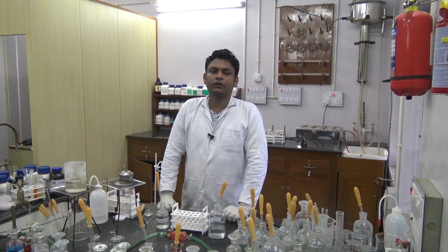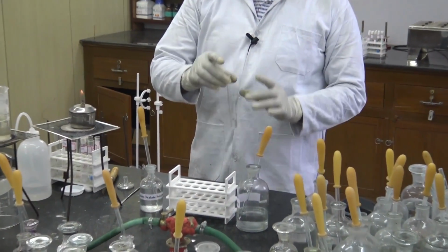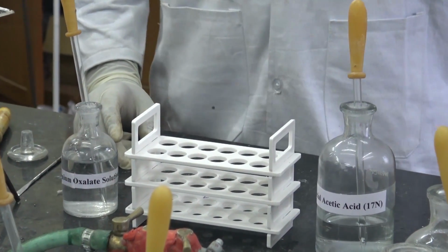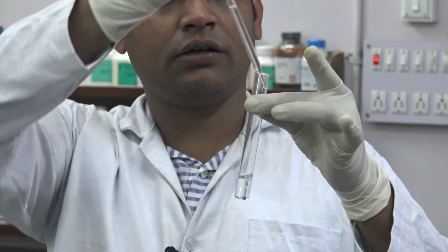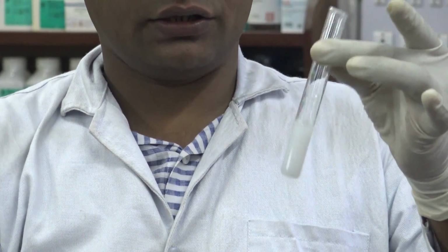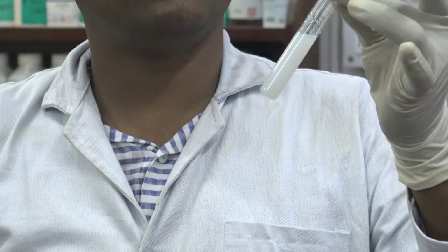Now we will go for the test for calcium ion, that is ammonium oxalate test. For this reaction we need sample solution, glacial acetic acid and ammonium oxalate solution. To perform this reaction we have to take the sample solution, then add few drops of ammonium oxalate to it. Here you can see formation of white precipitate occurs, which is insoluble in concentrated acetic acid, that is glacial acetic acid, confirms the presence of calcium ion in our solution.